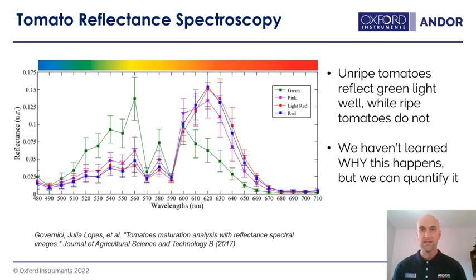From working with filters and lasers for so long at this point in my life, I have a pretty visceral reaction if someone says 480 nanometers. I can picture right off what that looks like, a nice brilliant blue. Over here, 480, super, super blue, really nice blue. You might not have that dialed in yet, and it might come with time if you care enough to. If you don't, you can always look it up.